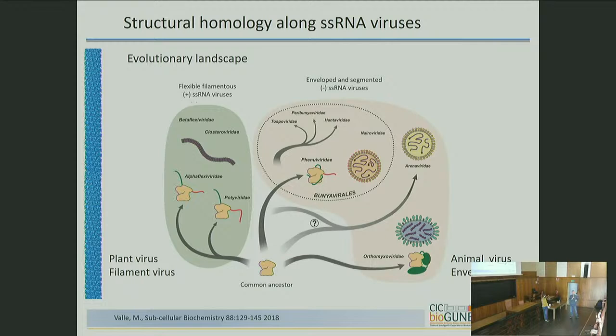Well, you mentioned using different constructs of RNA to improve resolution. What we have tried is to define the determinant for oligomerization in order to get a short segment of RNA, much shorter than the genome of the virus, and then make the tomography of the ends, because we can have short particles with both ends. But we couldn't get anything. No, it was not possible. We did different constructs of different RNAs and our collaborators also, but we never got any oligomerization in vitro.